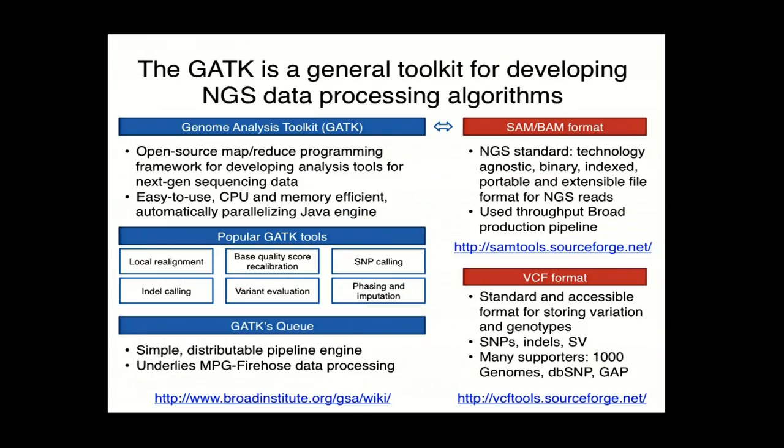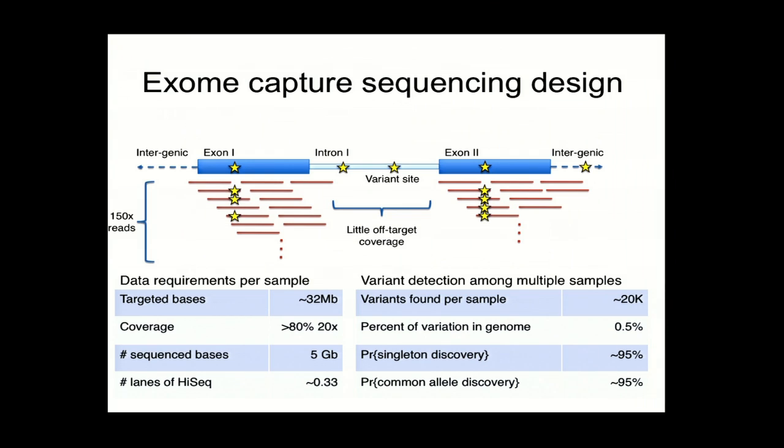OK, good. All right, so exome capture is basically the trade-off between, this is high-pass sequencing, but in select regions. And the cost here is the obvious one. There's little off-target coverage, so you will miss things that aren't in your targeted regions. Sort of obvious.